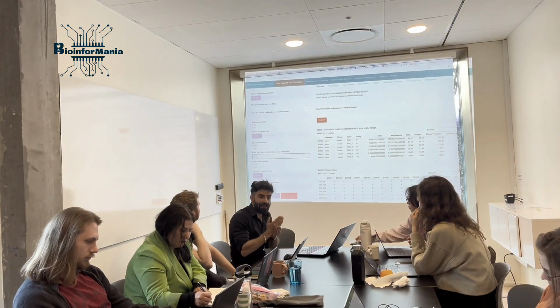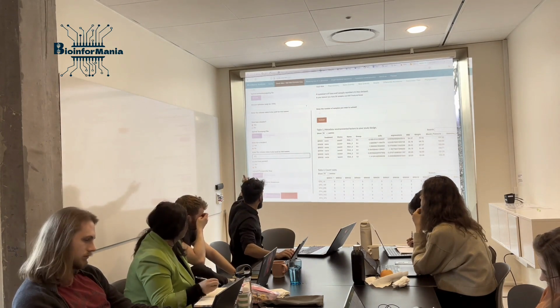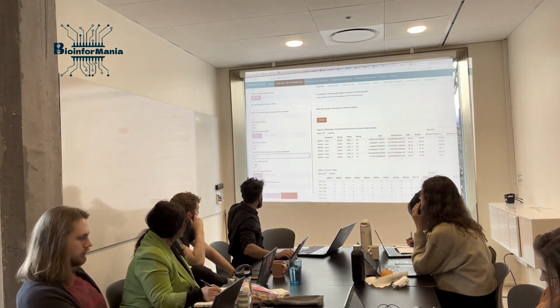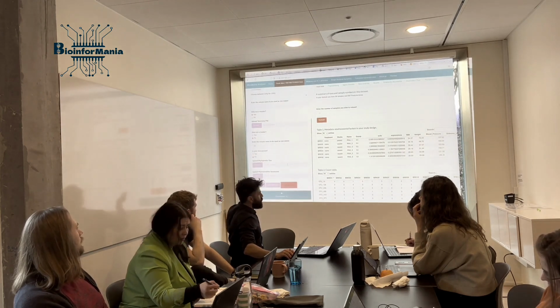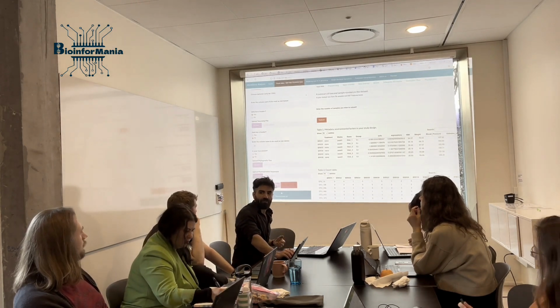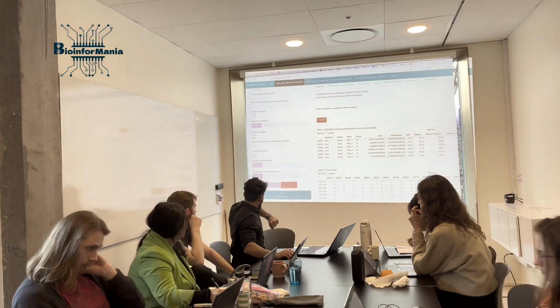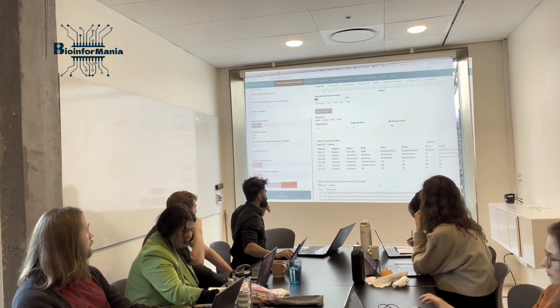Unless your data has a header, and you know which column. If it doesn't have a header, 2 column, unparsed, just give it x1, okay? And here, is your data parsed? My data is not. Yes or no, okay? No. Upload phylogenetic tree, if you have, not necessary, but it's good for phylogeny-based analysis. And then upload representative sequences, not necessary at all, just for demonstration purposes.